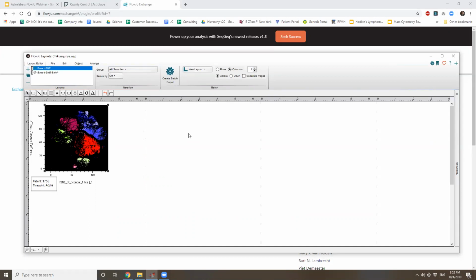I'd agree. I feel like there's a very nice workflow here where we can put the two tools together and super quickly come up with biologically relevant names that are easy to understand and show the differences between them, and get down to the real science of understanding what's happening between two biological systems, and spend less time fooling around with hands-on clicking and gating and so forth. Yeah, I agree. So I think I'm going to answer one last question.